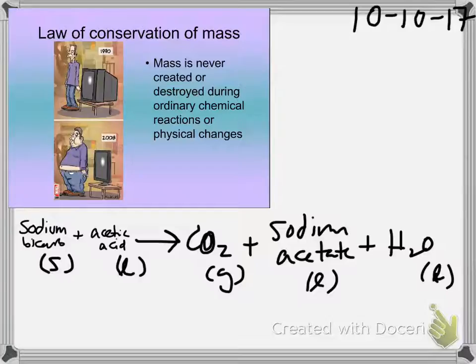It's tough. Honestly, you do it by creating your own glassware, putting your components in the glassware, then melting the glassware shut. Seriously, that's how they would have done it, to make a sealed vessel. That's the only way to do it. You wouldn't have been able to do it with the baking soda vinegar reaction that we ran, the acetic acid sodium bicarbonate.